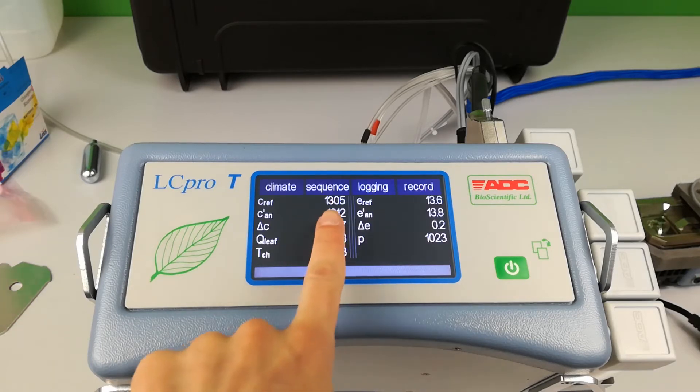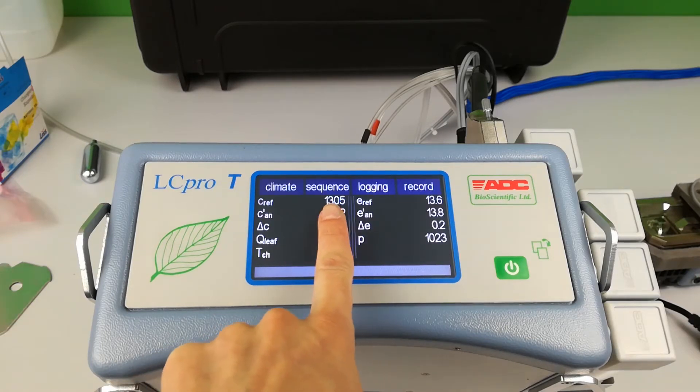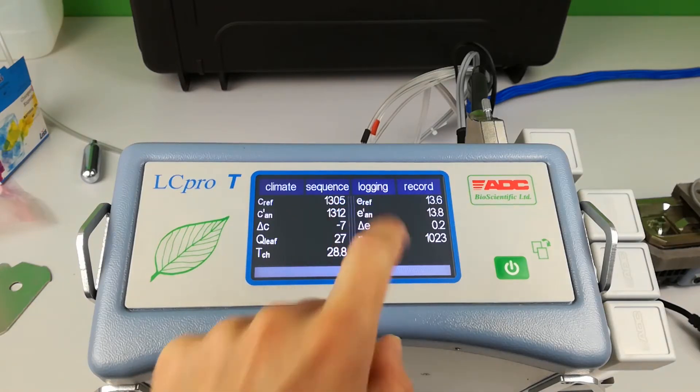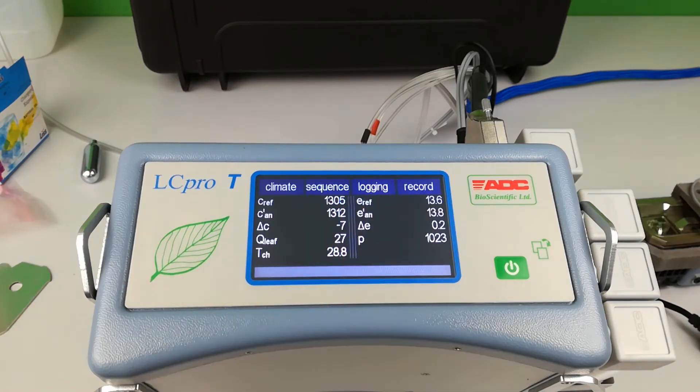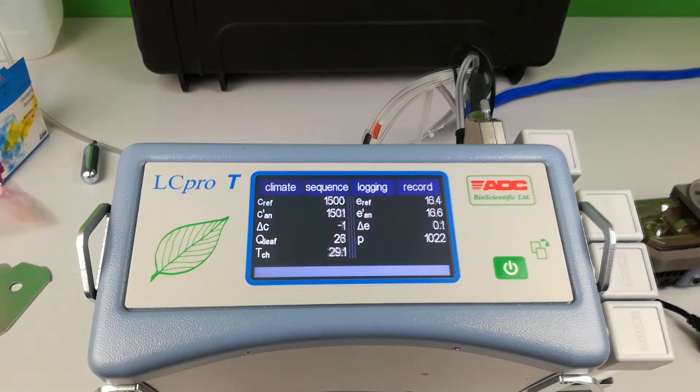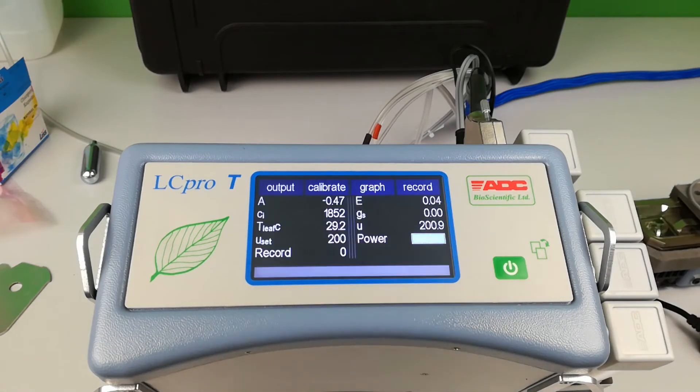An additional menu screen for the graph is now available as you swipe across the 4 screens.